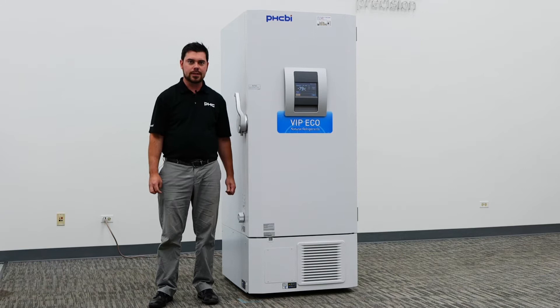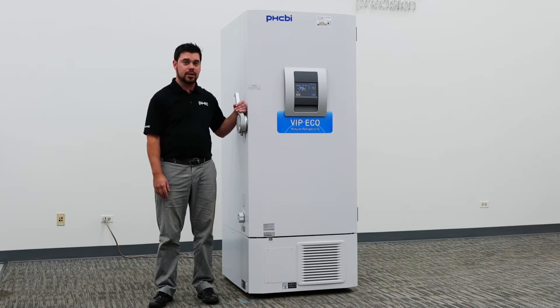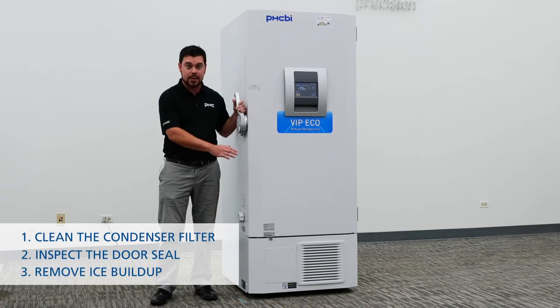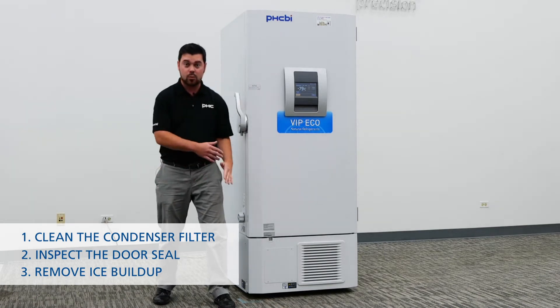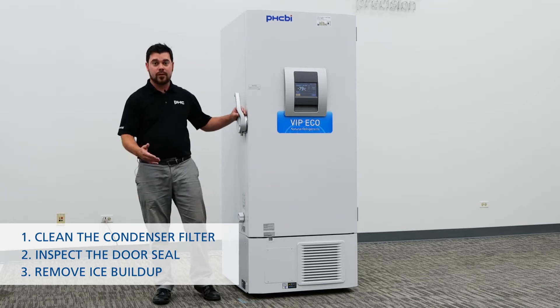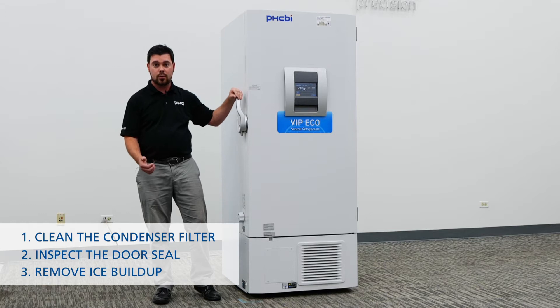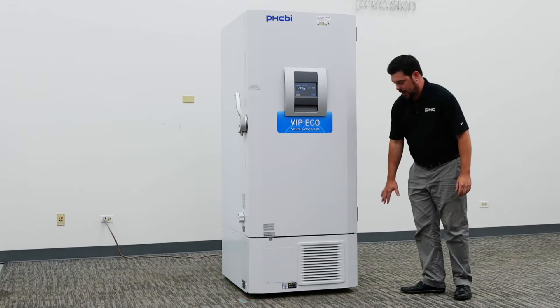In today's video we'll talk about the steps you can take to prolong the life of your minus 80 PHCBI branded freezer. There are three steps: first, the condenser filter — we recommend cleaning this periodically. Next is verifying good, adequate seals with all of your doors including your inner doors. And finally, ice and frost buildup removal.